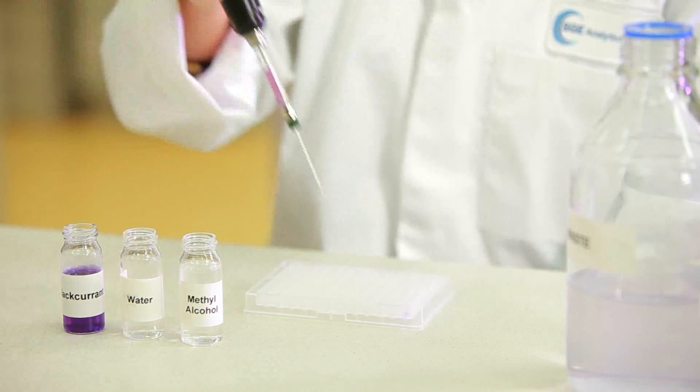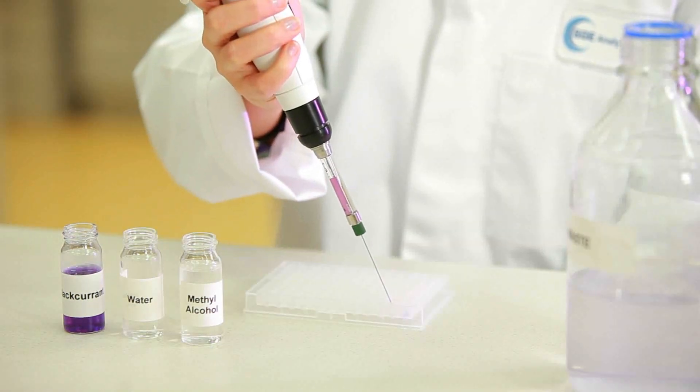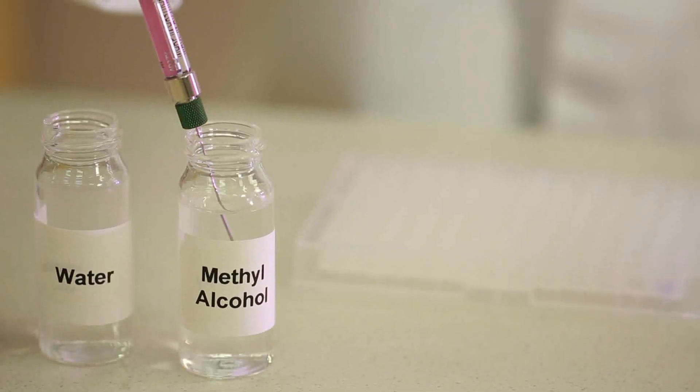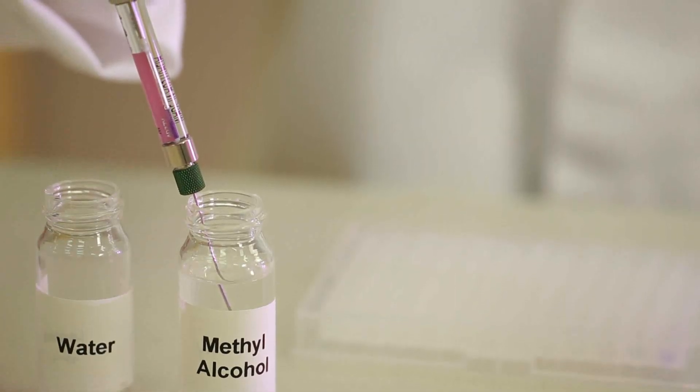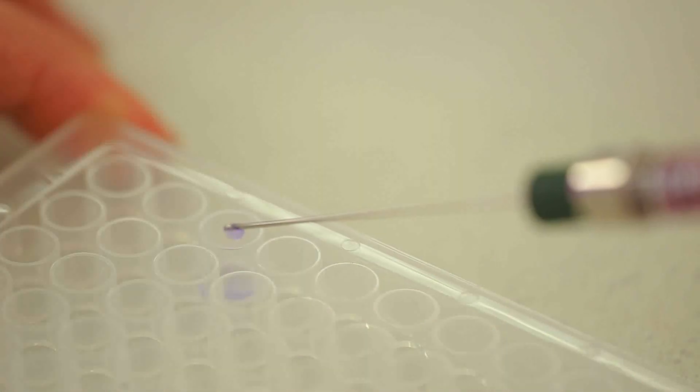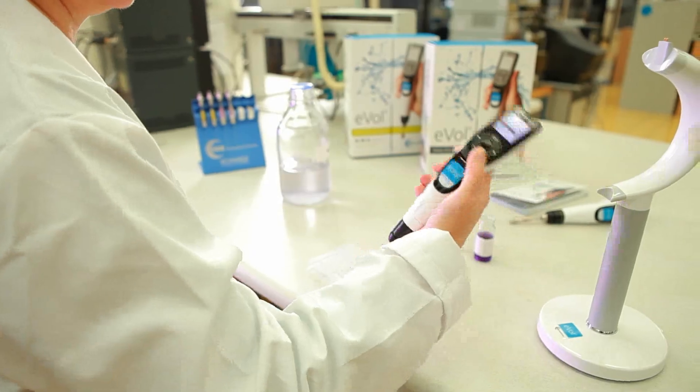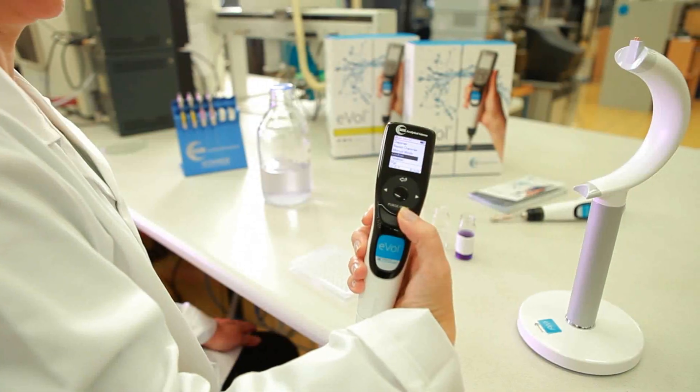The cartridge is now washed to remove any non-bound material. Again, the wash routine is predetermined by method optimization. Finally, the bound material is eluted using methanol. EVOL introduces reliability and efficiency in sample preparation. It is simple to program and removes inter-operator error.